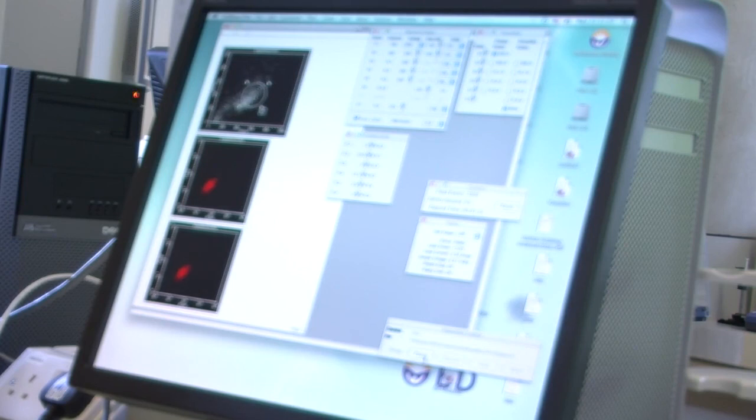Yes, so that's why in this paper, for example, they are combining the immunofluorescence, where they stain the cells that are still attached to the surface, so to the growing plate. Right. Otherwise they need to detach them. So you can see the morphology of the colony, how the cells spread, you can see exactly how they are, right? And that's where they do the staining. You can also detach them and splash them on a slide and do the same procedure.